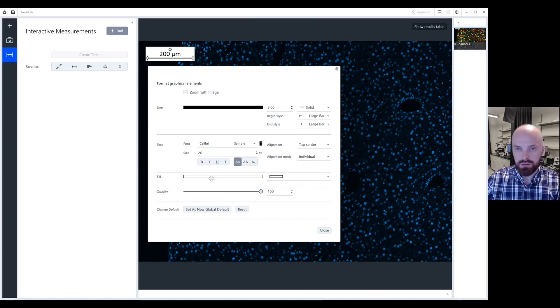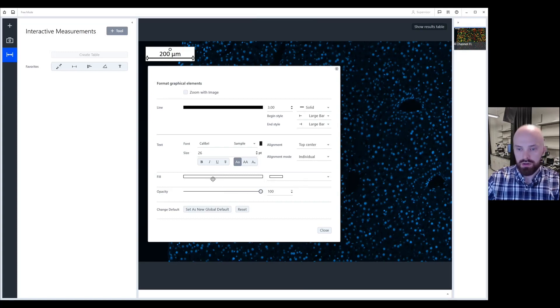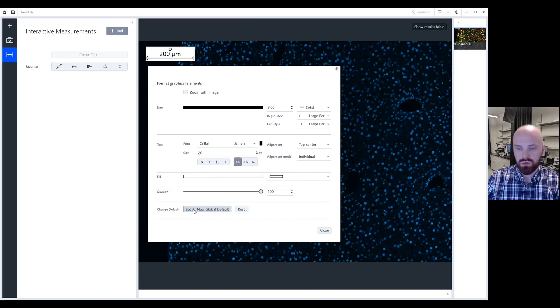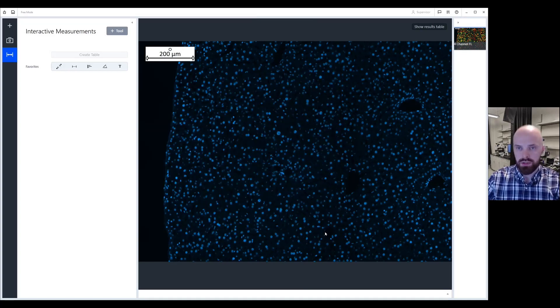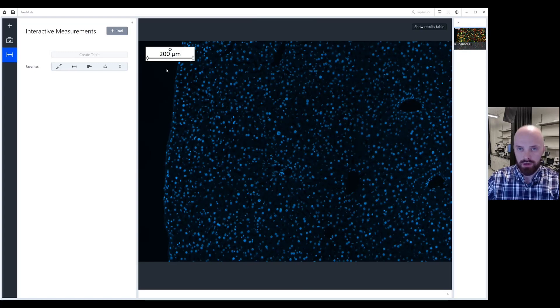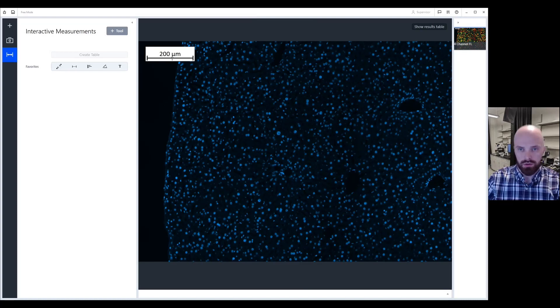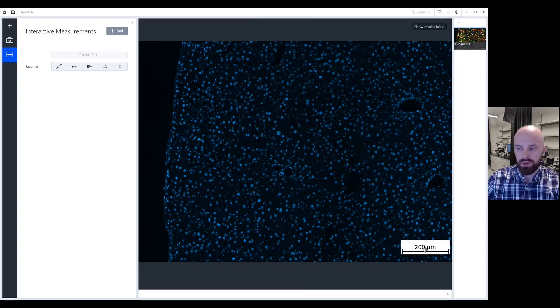If you would like this to be the default setting for each scale bar, simply click set as new global default. After you close this window, every image will then have the default scale bar with the settings that you chose today. Please note the location of the scale bar will always appear at the bottom right hand corner of your image.